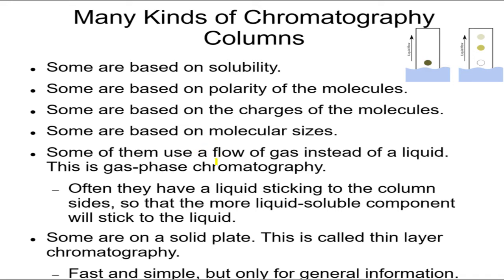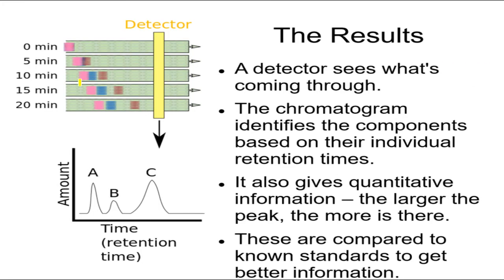Some of them, these often separate faster and more clearly. They use gas instead of a liquid. This is a very interesting idea. A gas flows through. It's not a liquid. We take, let's say, argon, some inert gas, and we have this gas flow through.